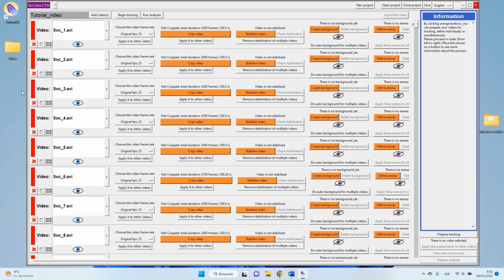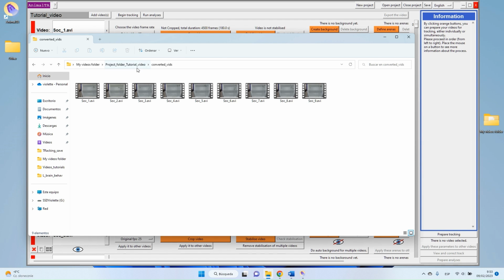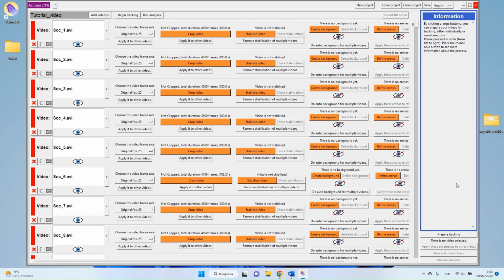Just before going into the details of the table, I would like to show you what happened to the converted videos. As I explained before, when you create your AnimalTA file, this one, a project folder was also created in the same location. When we checked before, this project folder was completely empty, but now, as you can see, there is a subfolder called Converted Videos, and inside this subfolder, you will find all the videos that have been converted. Okay, let's go back to AnimalTA itself now.